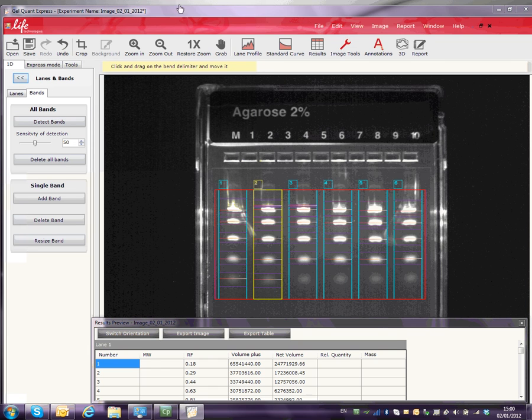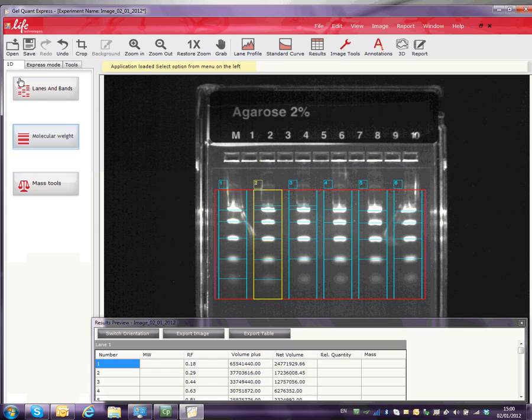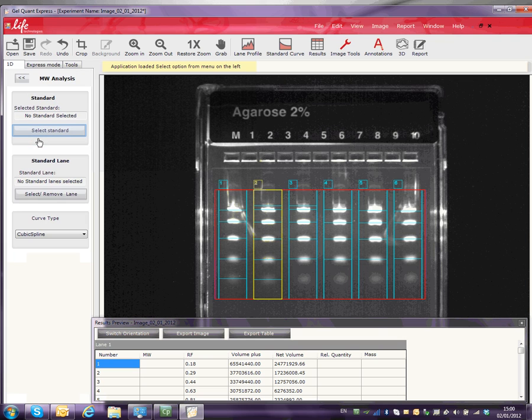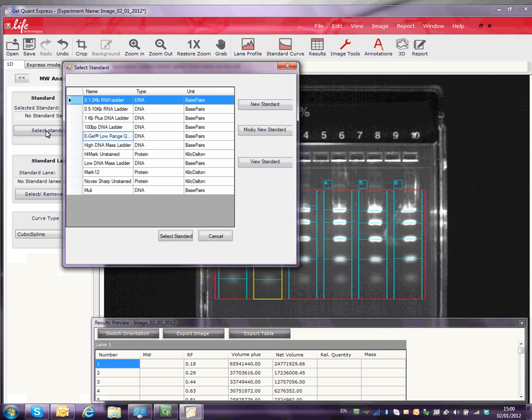Click on the double arrow to go back to the main menu. Select the Molecular Weight Analysis button. Now click on the Select Standard button and choose the appropriate standard.